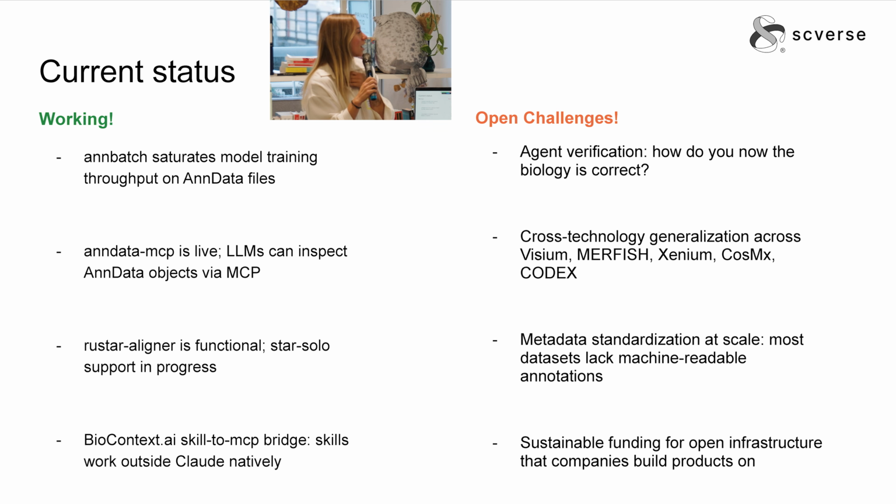That's the main question. And then we have the issue that a lot of things now are demonstrating some technologies, especially with agents and the pipelines. And then you have similar technologies. Here I demonstrate, I don't know, Visium, MERFISH, Xenium, CosMx, and CODEX. The pipelines don't work from one to the other, even though they should, since they produce similar results. And that's, in my opinion, an issue because you want as general as possible, and then you need to think, why does it work? If the data are similar, why does it work in one and not in the other modality?